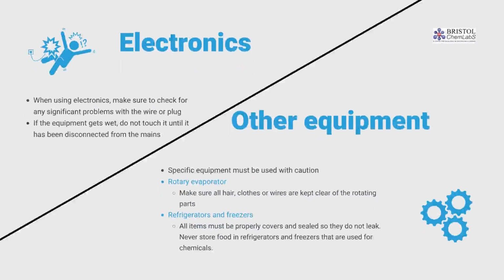When using electronics, make sure to check for any significant problems with the wire or plug. If the equipment gets wet, do not touch it until it has been disconnected from the mains. You must also be aware of specific equipment in labs.